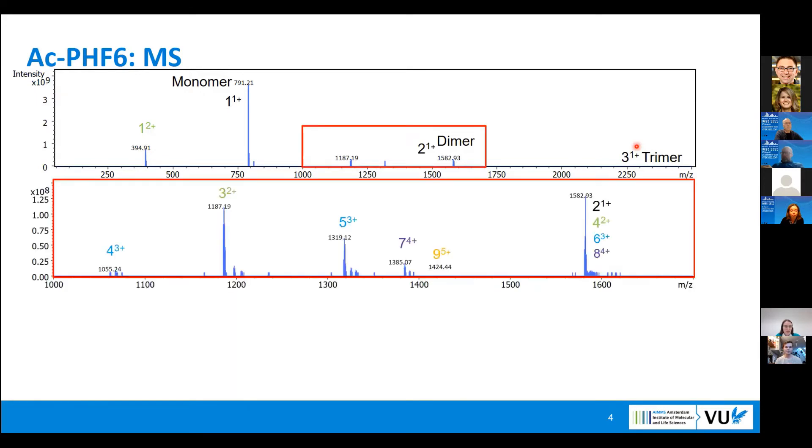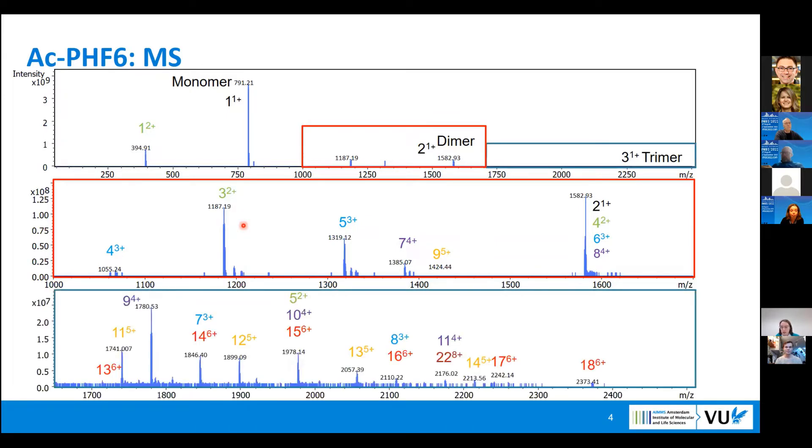But if we zoom in more, because we're interested in aggregates, we actually start seeing more oligomers. If we zoom even more to the higher m/z values, we see even larger oligomers. Here I already gave the assignment of the peaks, like here multiple oligomers present. But how I do it, I will explain a bit later.